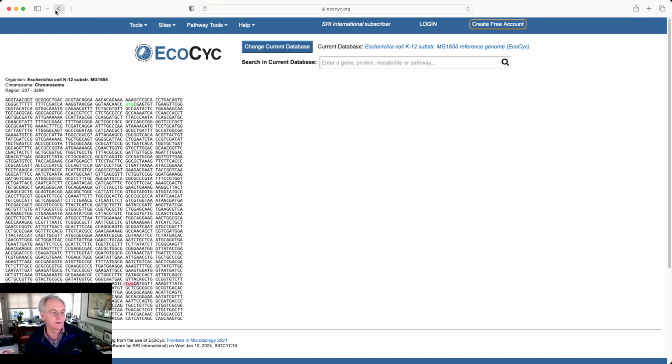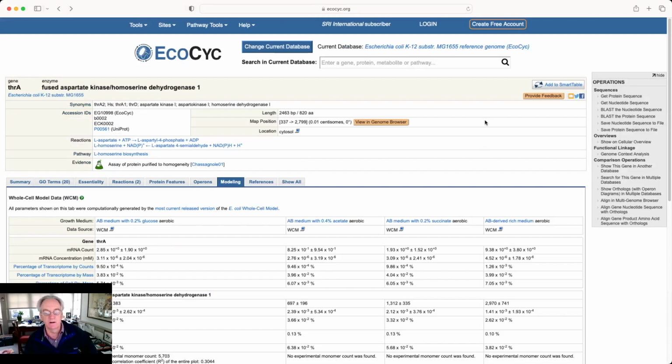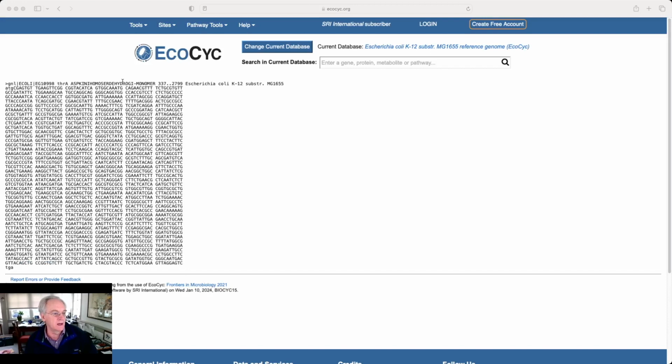But the region you select does not have to be limited to being right around the coding region. It could be the entire chromosome if you wish. Going back to this window, you can enter whatever upstream and downstream offsets you like, or simply change the left end position or right end position directly and click Reverse Complement to return the complement.